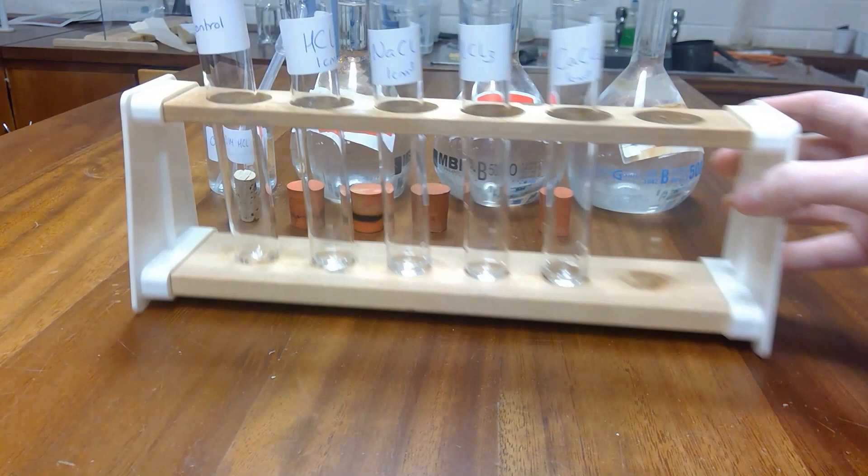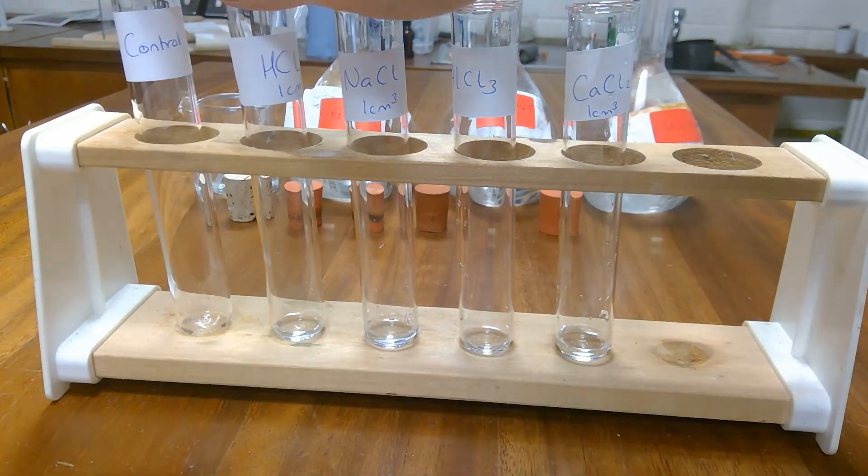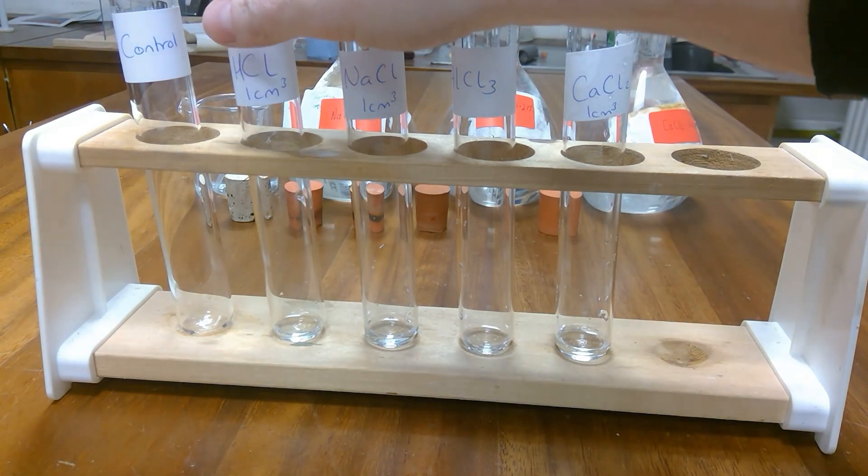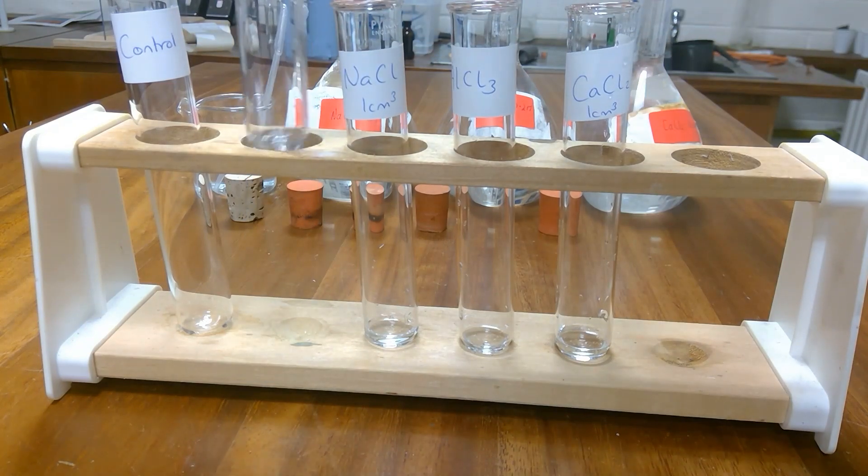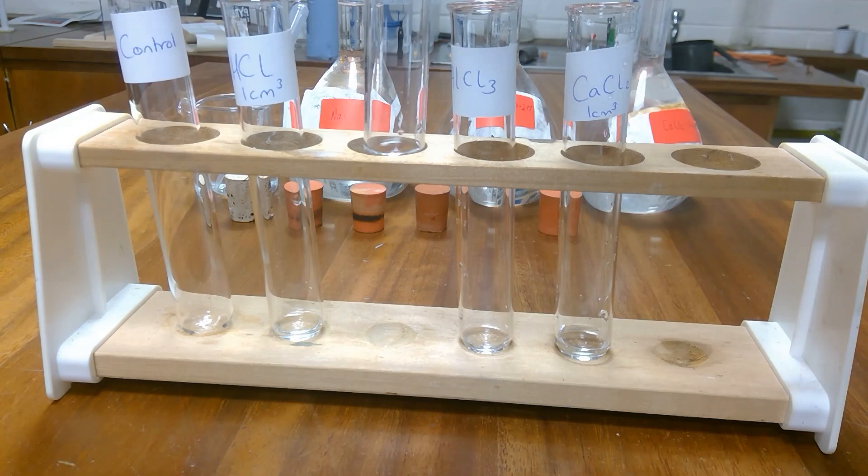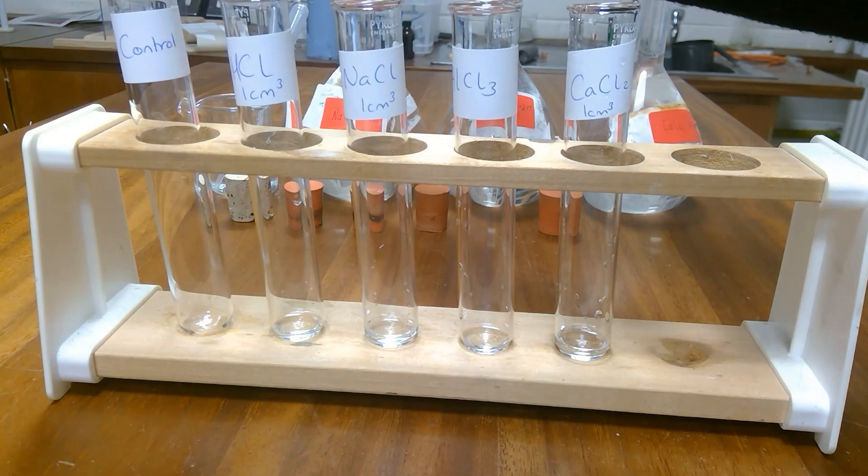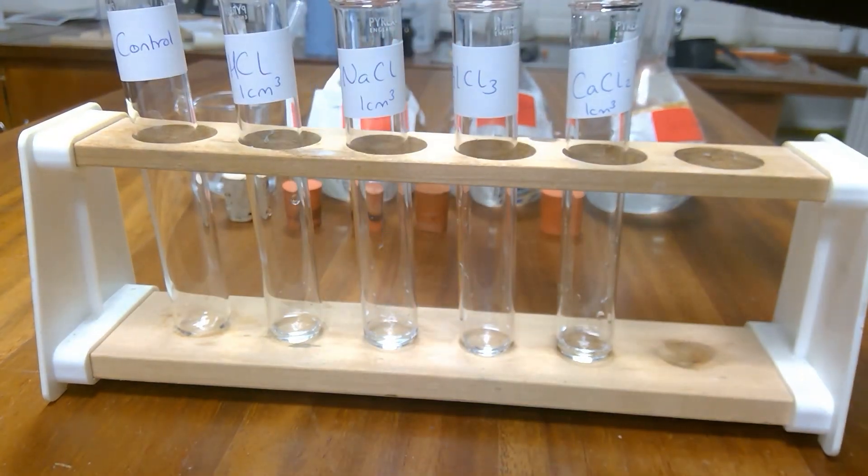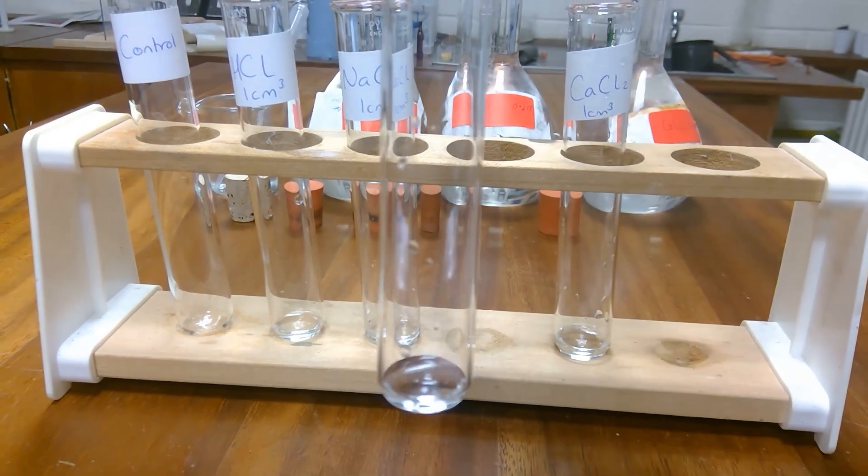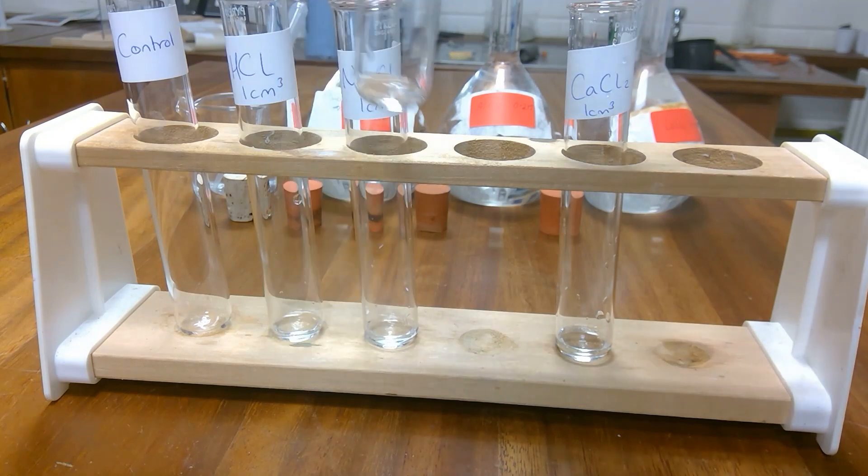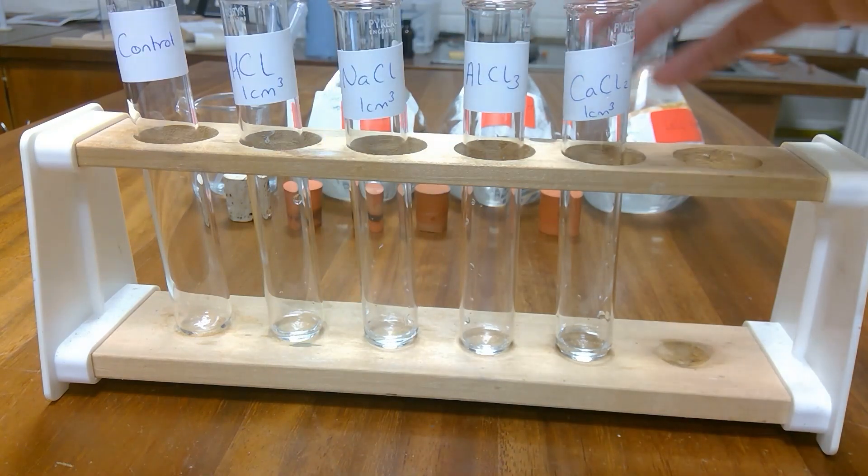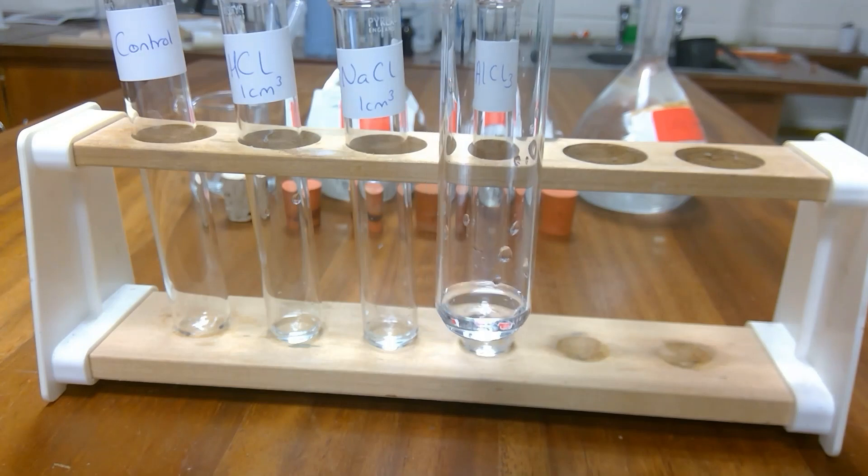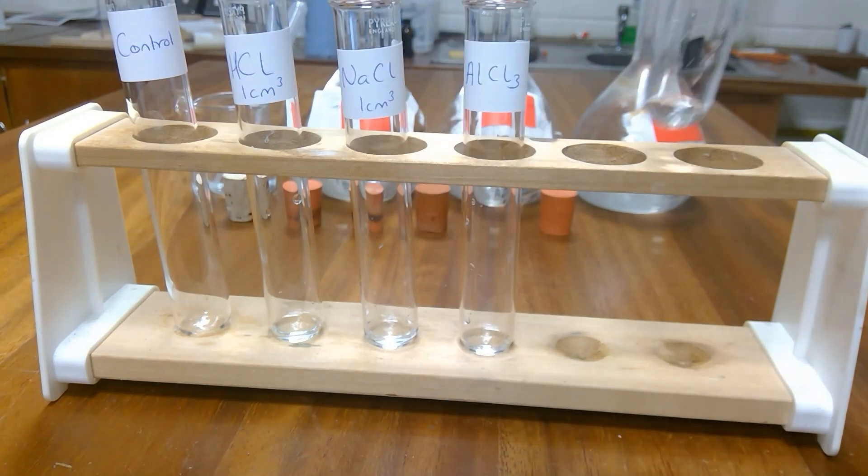So before we use the chemicals, I just want to show my test tubes here. I have my control. I'm going to be using 1 centimetre cubed of 0.1 molar hydrochloric acid. And I have that already in the test tube and measured out. I'm going to use 1 centimetre cubed of sodium chloride. And the sodium chloride is 0.1 molar. And then I'm going to use aluminium chloride, which is AlCl3. And again, I have the 1 centimetre cubed and I have my test tube labelled. And then I have 1 centimetre cubed of calcium chloride. And the calcium chloride is 0.5 molar. And again, I have 1 centimetre cubed of that already in the test tube.